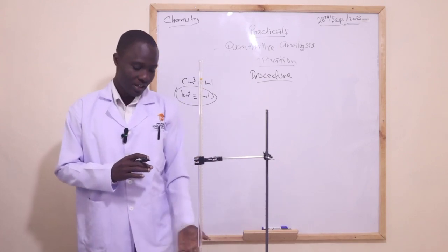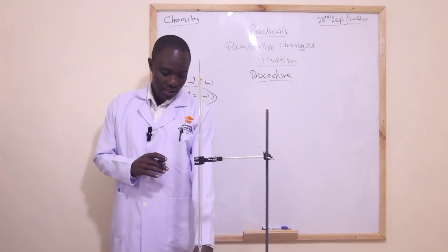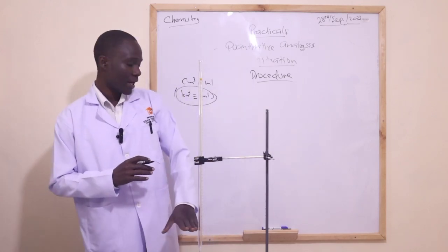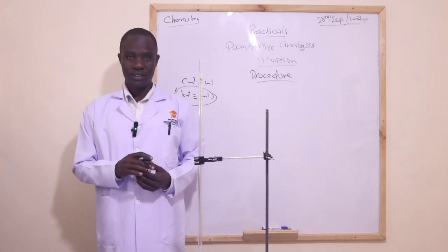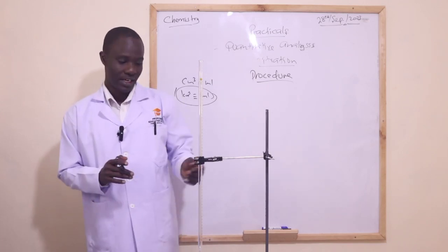So you need to have adequate space between the base of the stand and where the tap is. That must be considered.